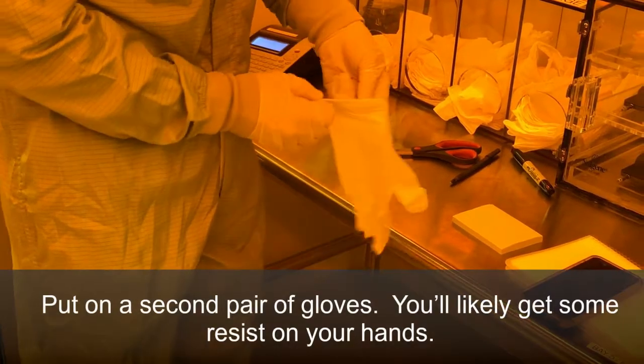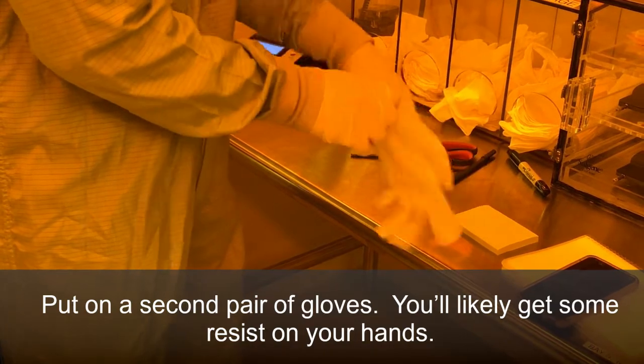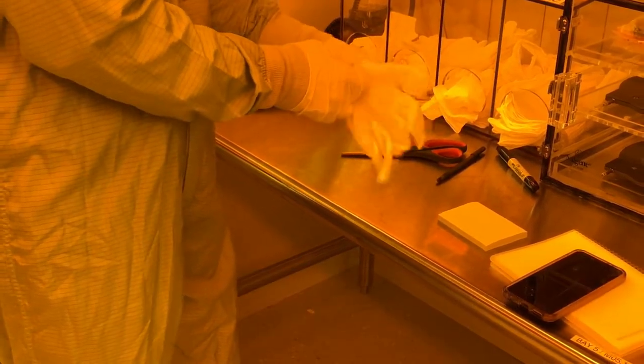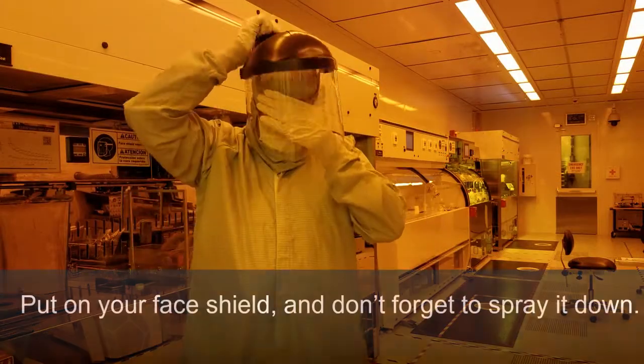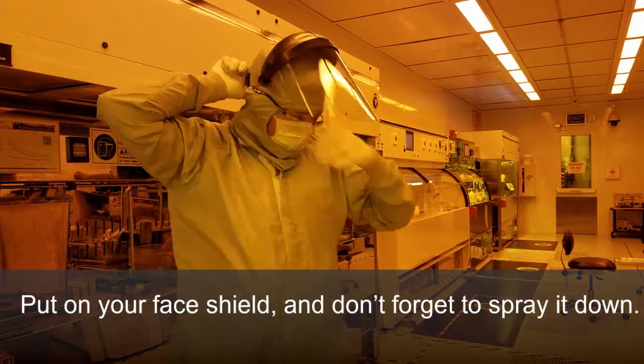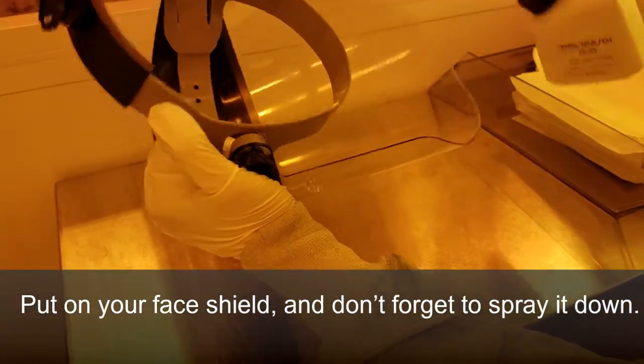Put on a second pair of gloves — you'll more than likely get some resist on your hands. Put on your face shield. Don't forget to spray it down.